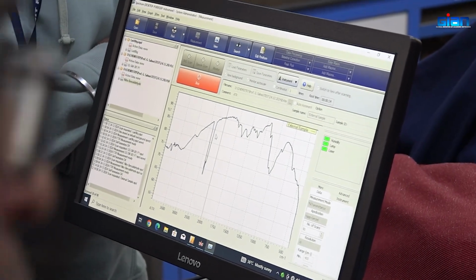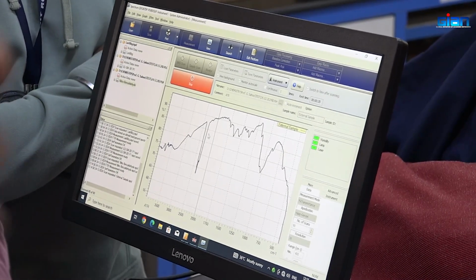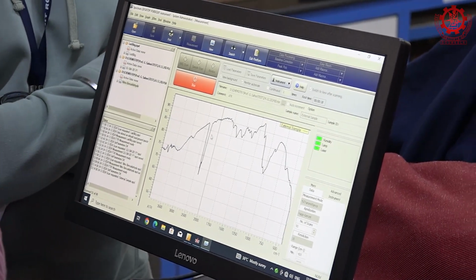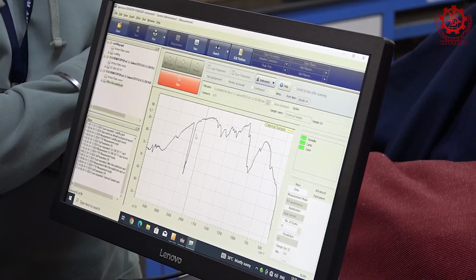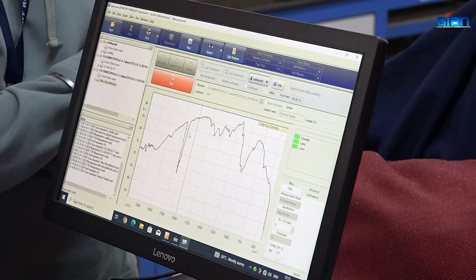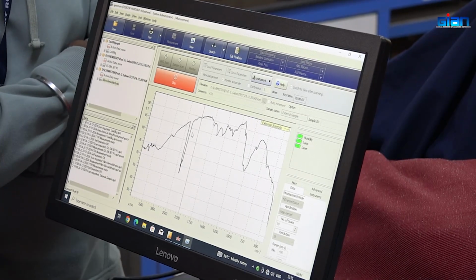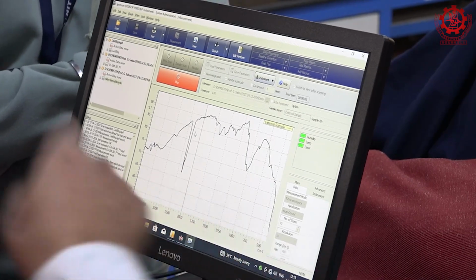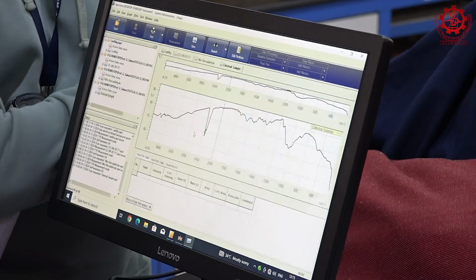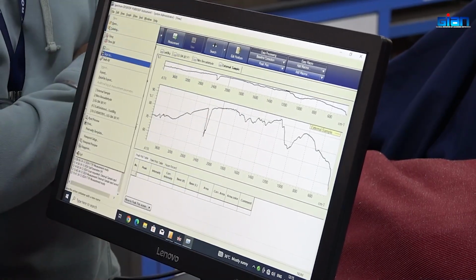hello. This sample, do you have any idea what the functional groups are or what the structure is? No. Acetyl. Okay. So anyway, I'll explain. Now you see what is the difference between those samples and this sample. I'll tell you. Okay. Now this is the spectrum. What do you see?